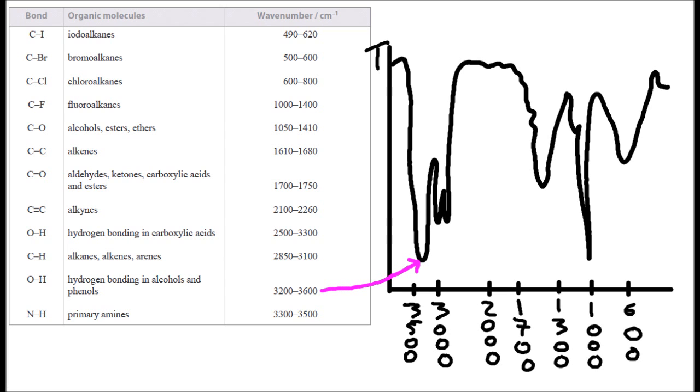So to me, that looks like that could be hydrogen bonding in alcohols and phenols, that blobby there. The other one coming down, alkanes, alkenes, arenes. Okay, I believe you.